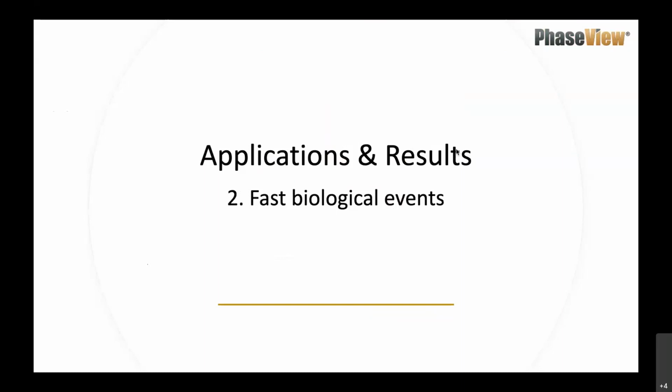Of course, if you have very weak signals, the light sheet can be a good option because there is low photobleaching, so it will be easier to image your signal. And if you have a really sensitive mutant, for example, it can be easier to use the light sheet because you have less phototoxicity, so it will be easier to image this kind of sample.